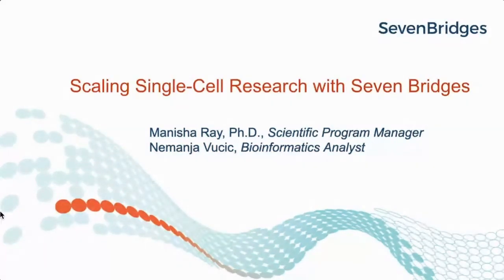My name is Manisha. I'm a program manager at Seven Bridges. I work with the Cancer Genomics Cloud. And I'm very excited to tell you today about some tools that we've developed to make it easier for single-cell researchers to do their data analysis on the Seven Bridges platforms.